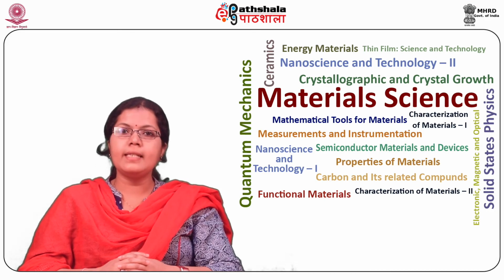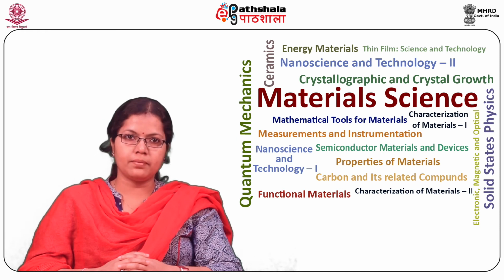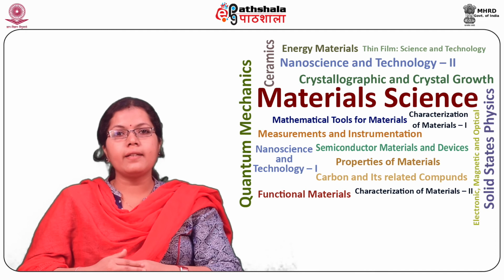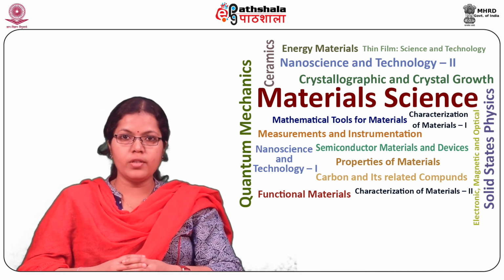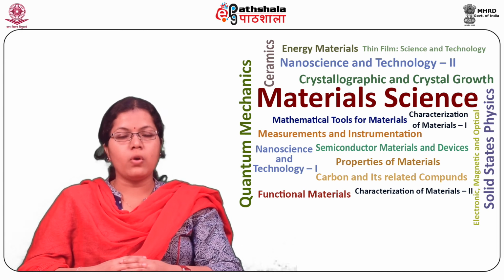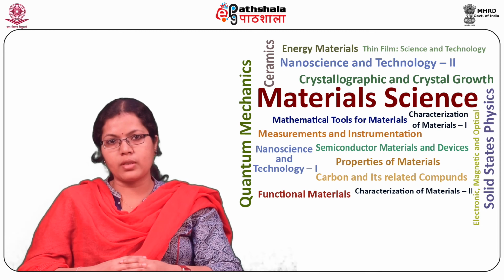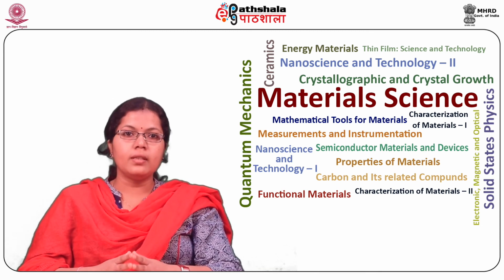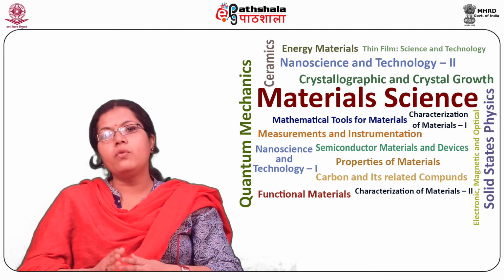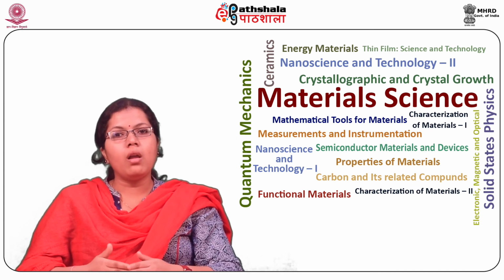The ET detector is schematically illustrated in figure 7. It is basically a scintillator photomultiplier system. The secondary electrons are first collected by attracting them towards an electrically biased grid at plus 400 volt to plus 500 volt and then further accelerated towards a phosphor or scintillator at about plus 2000 volts. The accelerated secondary electrons are now sufficiently energetic to cause the scintillator to emit flashes of light, that is CL, which are conducted to the photomultiplier outside the SEM column via a light pipe and a window in the wall of the specimen chamber.